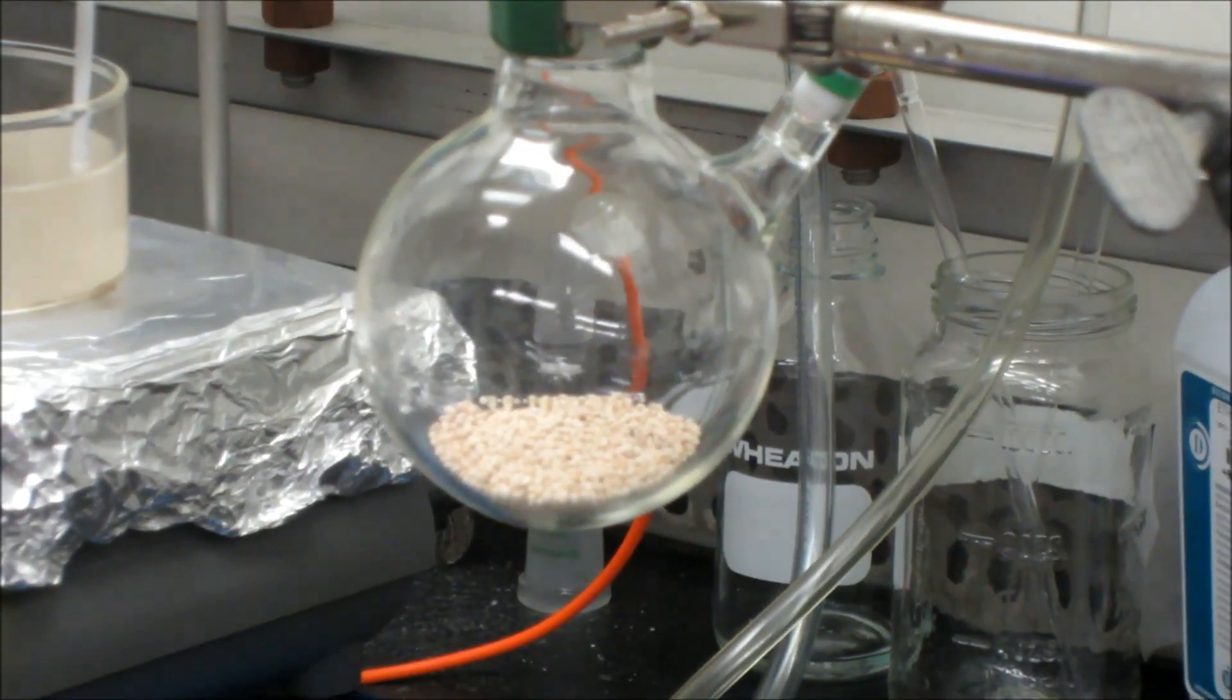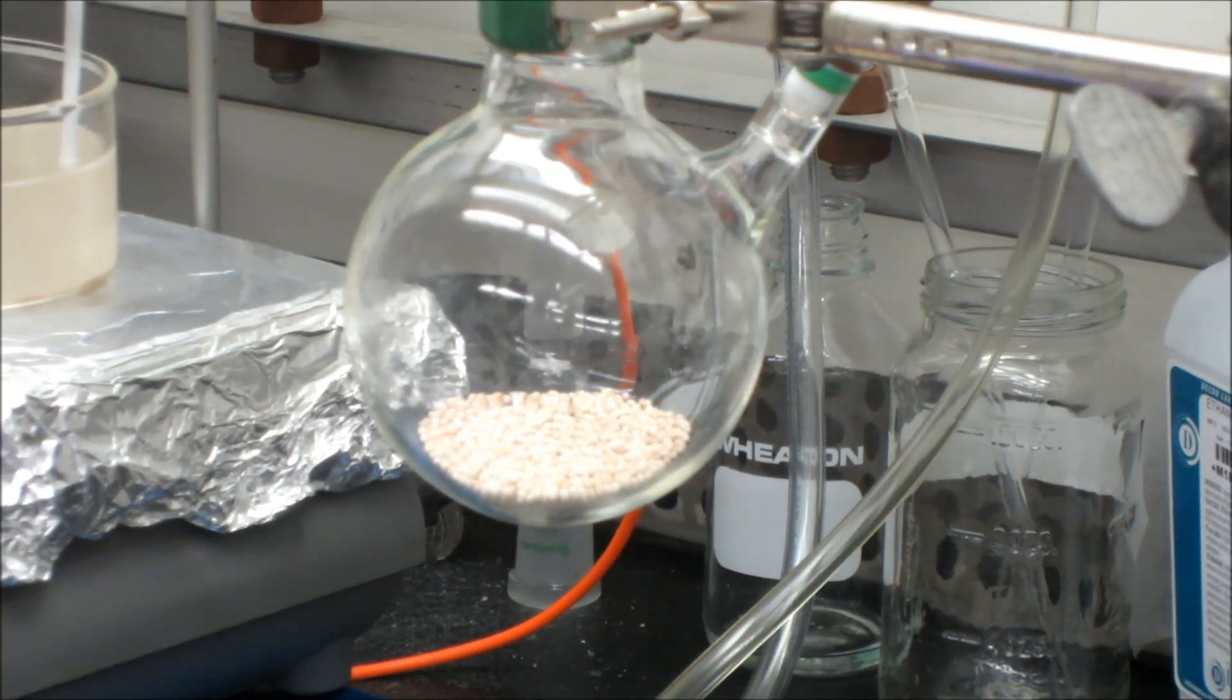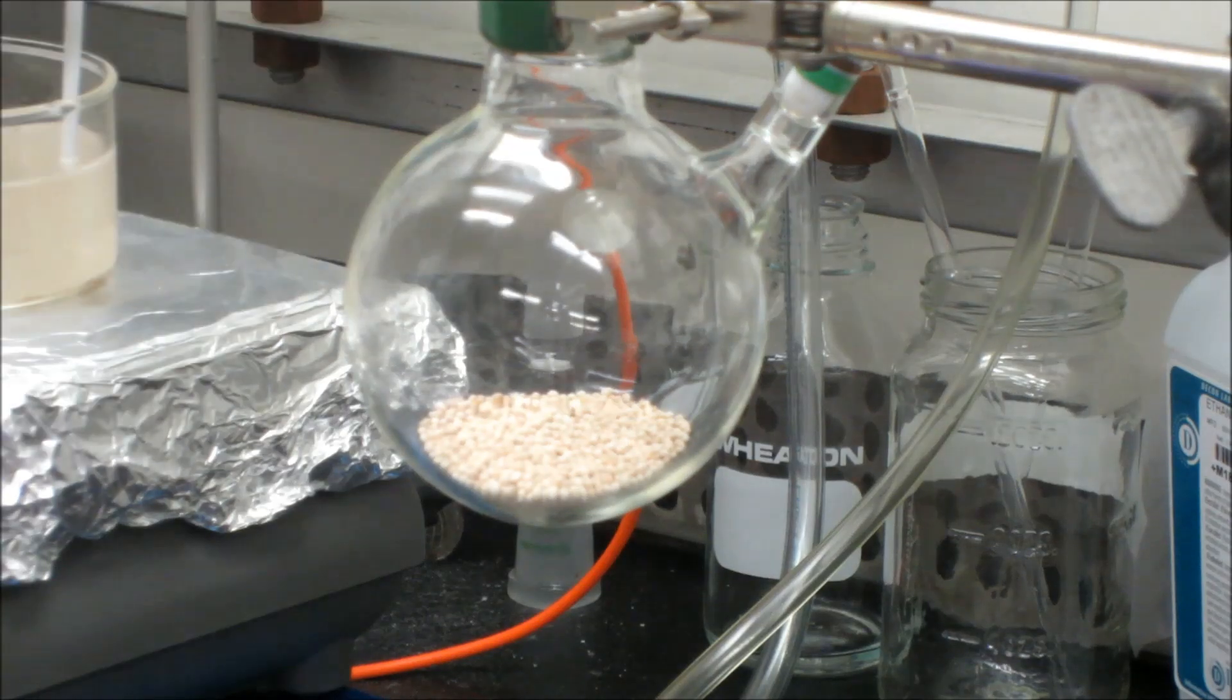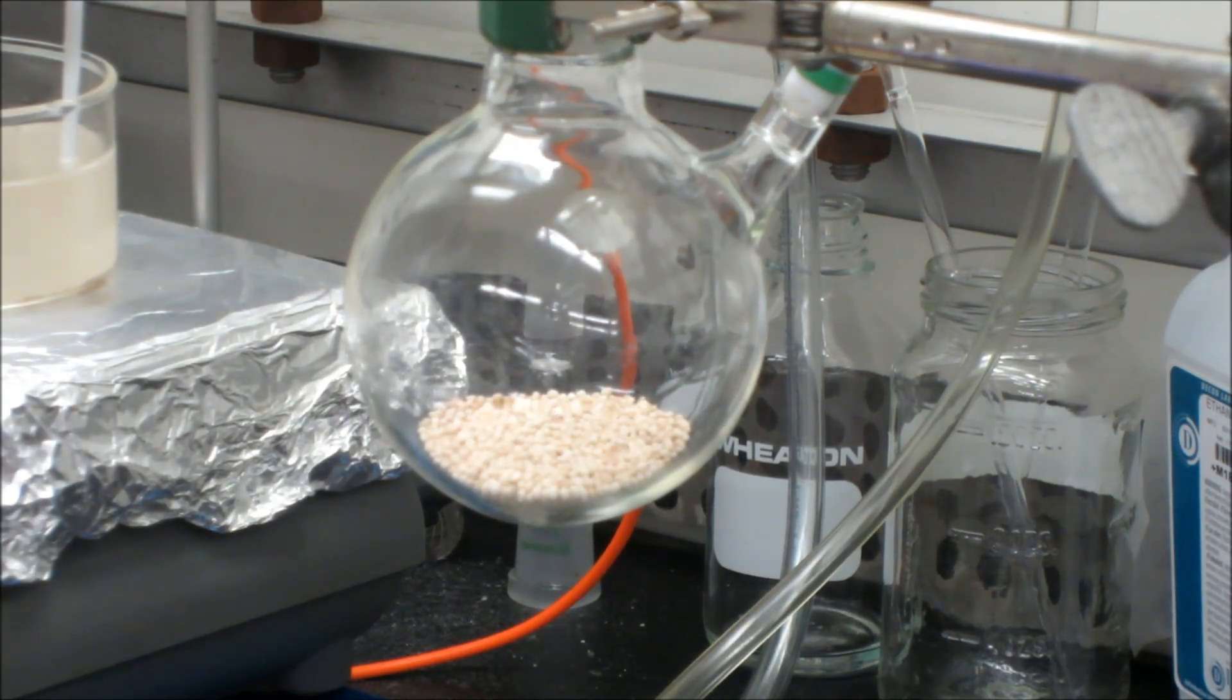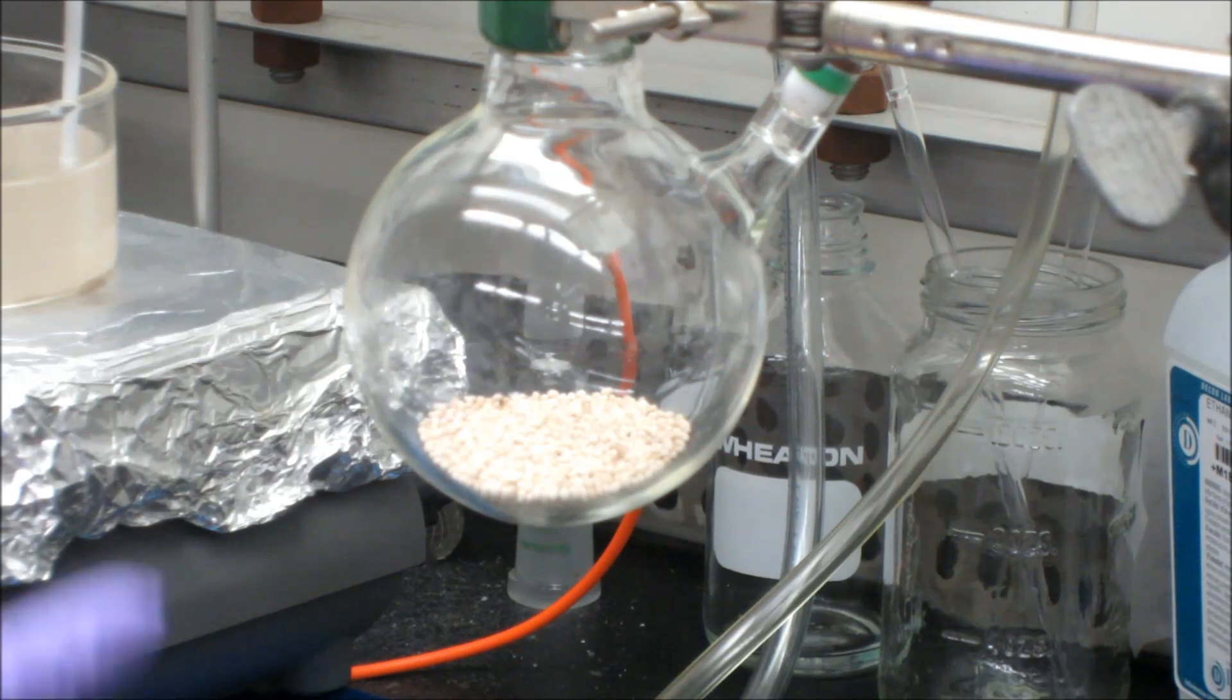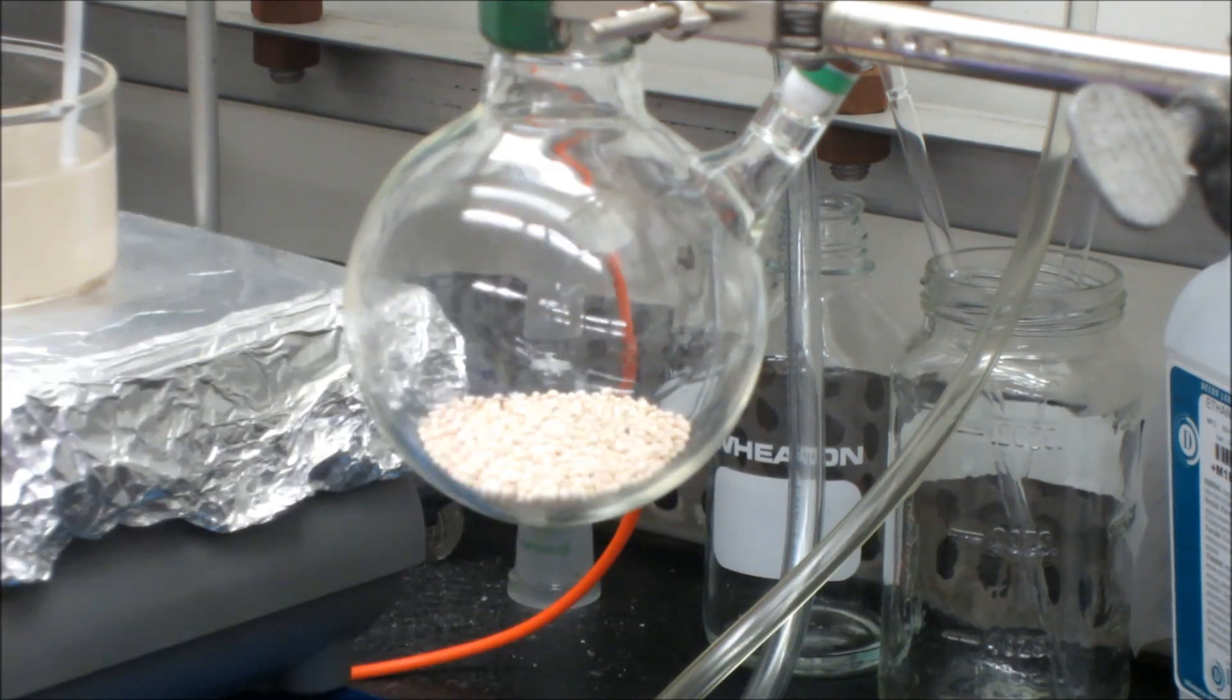So what we do is shut the system off to nitrogen and then open it up to vacuum. So now that this is open to vacuum, the water that is condensed is going to get pulled in and collected by the trap.